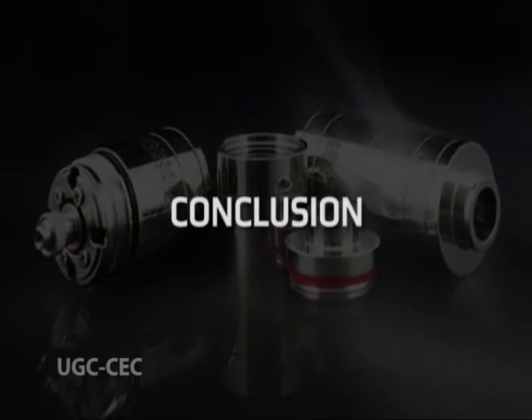So here is the conclusion. Atomic absorption spectroscopy to this day has maintained a top position in most of the academic and industrial laboratories due to its affordability and range of applications. Modern developments and advances in electronics and automation made it possible to increase laboratory applications in different areas of chemistry, such as clinical analysis of metals in biological fluids and tissues such as whole blood, plasma, urine, saliva, etc., in some pharmaceutical manufacturing processes.